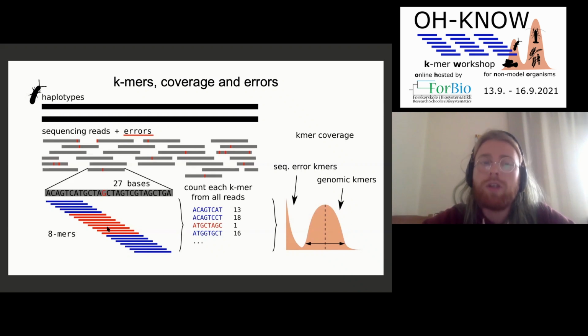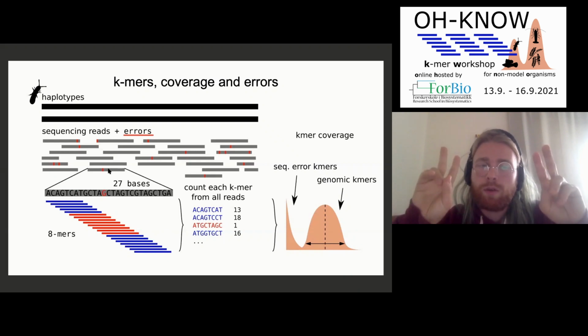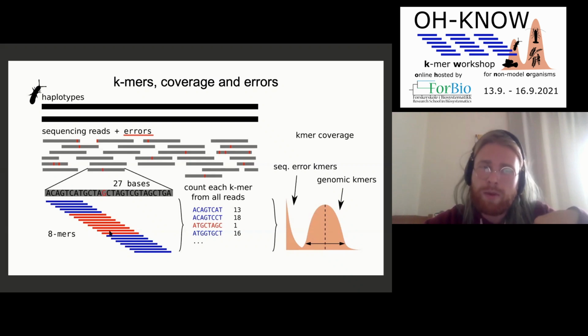But if the errors are rare and the depth is sufficiently good, then basically the whole stack of reads represents exactly the same sequence. I will sample this Kmer 1, 2, 3, 4, 5 times in the visual example, but in reality it's usually a lot more than 6 times, so I will have a lot of the real correct Kmers. Only a few positions will get an error, and few error Kmers around it, which means errors being rare will form a distribution with a much lower mean, and as a consequence it will have this shape. So it's because it's a Poisson distribution, right? It's like rare sampling versus frequent sampling. If we have enough samples, then we get something that looks normal, while if we have few samples, we will just have this kind of shape that goes steeply down.